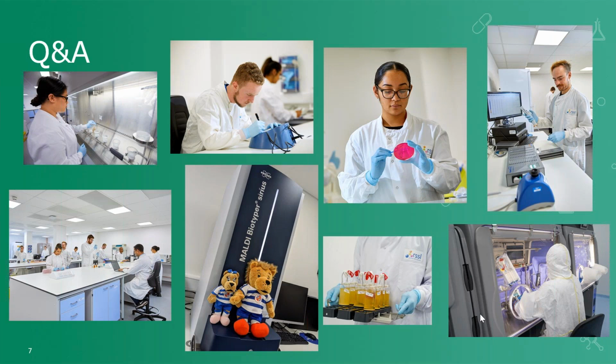Okay. Eugene also asks, in adherent cell cultures such as stem cells, would you consider taking a sample from the supernatant or the cell suspension for a sterility test?